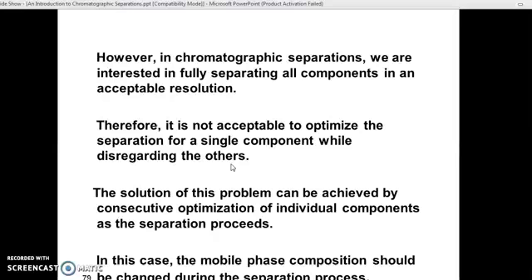Whatever the problems we have, the consequence of this is that the optimization of each individual compound is definitely separate, because each composition is different, each structure is different, and how that structure of the compound reacts with the stationary phase is different, and the mobile phase composition is also different during the separation technique. So each single component in your mixture should be very well defined and specifically designed in such a way that it has a prominent retention factor with resolution from the others. Okay.